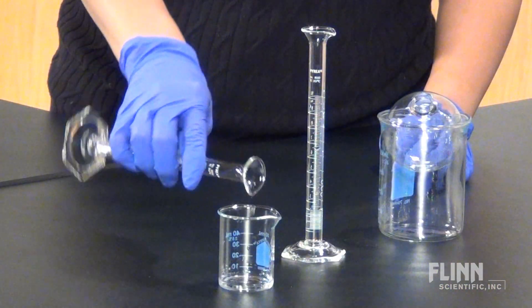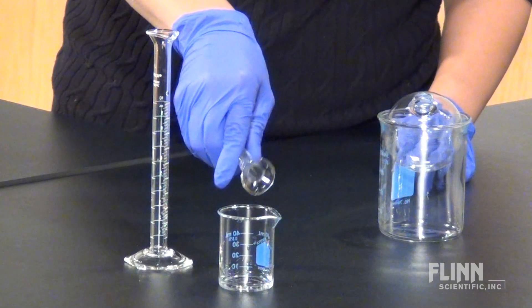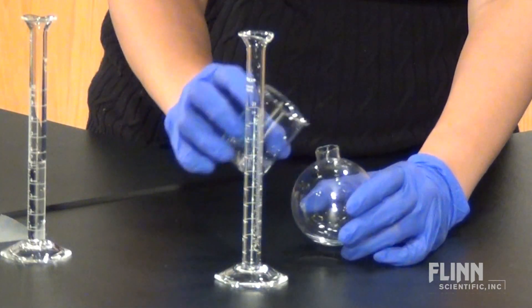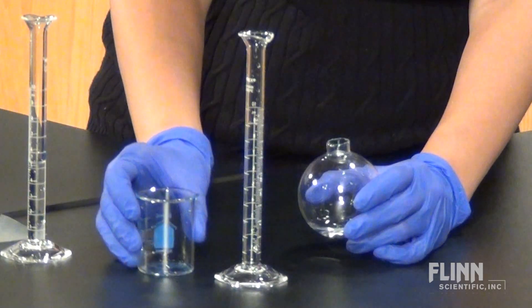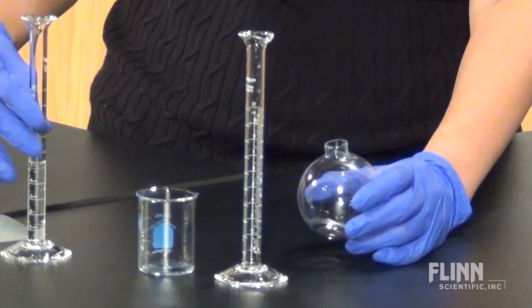Combine the silver nitrate and ammonium nitrate in a small beaker. Add the dextrose solution and silver nitrate mixture to the glass ornament, then immediately add the sodium hydroxide solution.